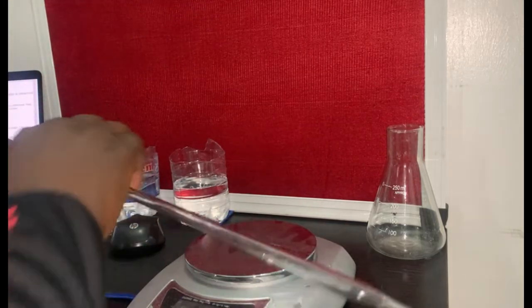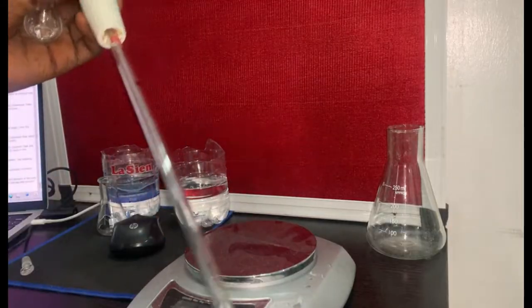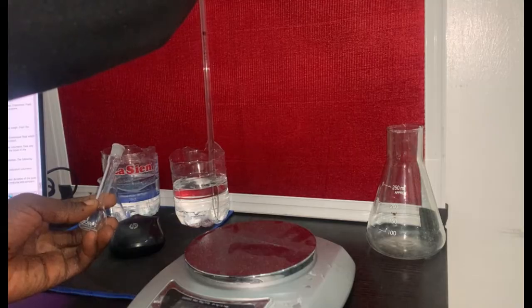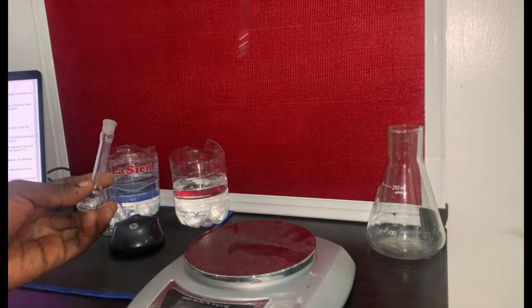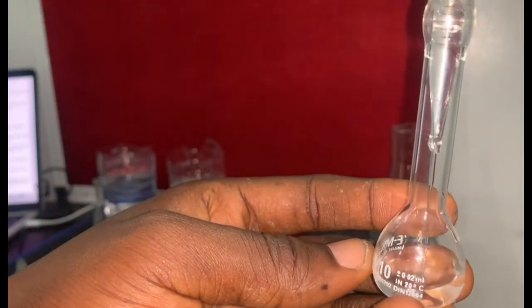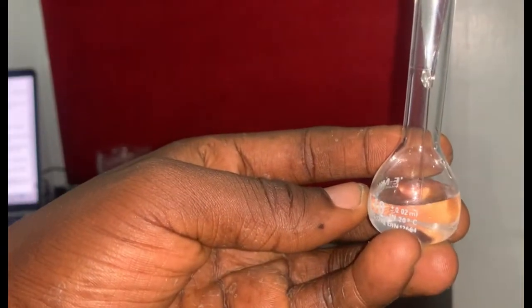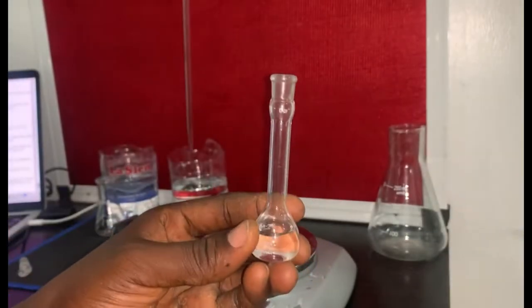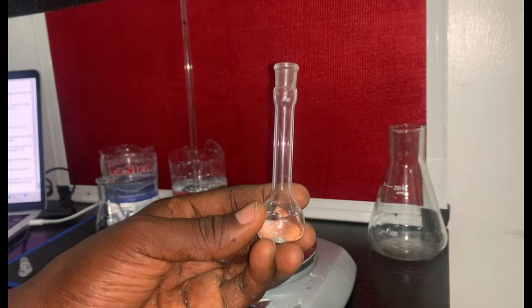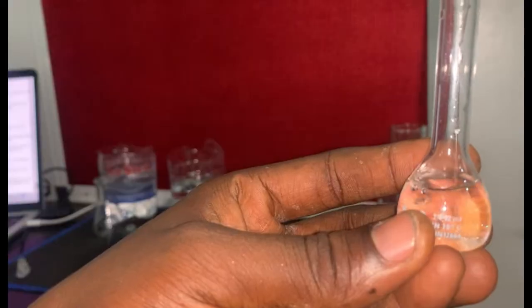So I'll plug in. I take my water. I come here. You notice there's nothing inside this flask. I release this. It has not reached the mark, so I come back again and take more water. I need to be very careful so it doesn't exceed the mark.